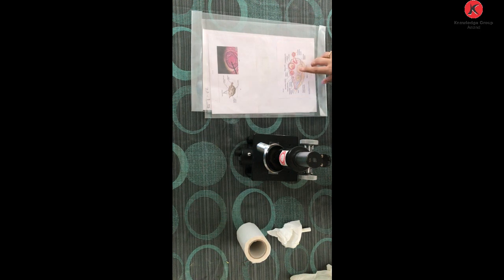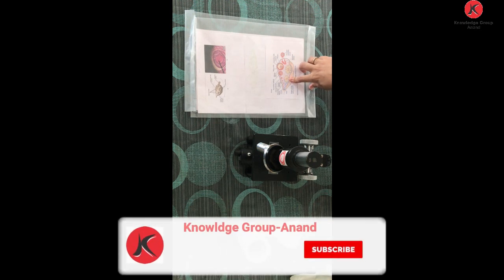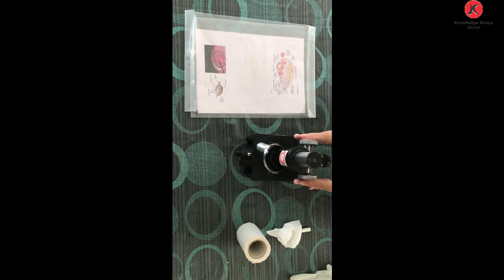We will be observing the different developmental stages, where a mature follicle, that is a Graafian follicle, will be forming, having the antrum, and then sometimes we can see the ovulated secondary oocyte that has been released. Corpus luteum and degenerating corpus luteum can be observed in this slide. So different stages can be observed. You have to identify them and describe them.